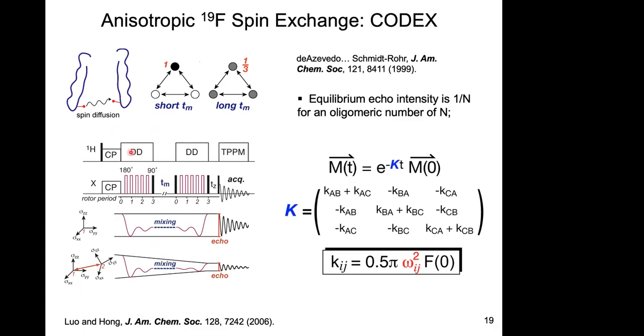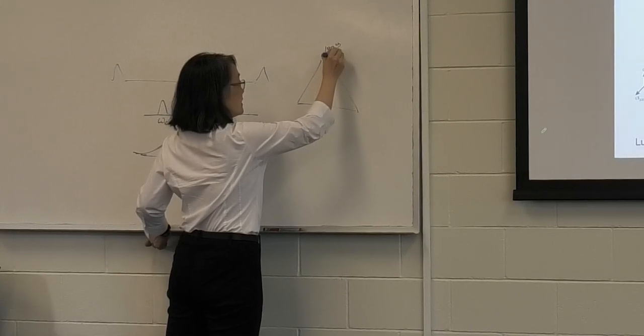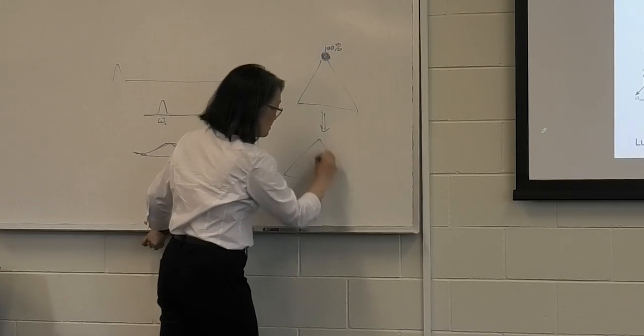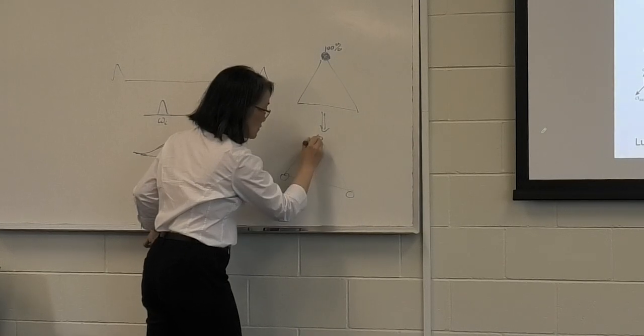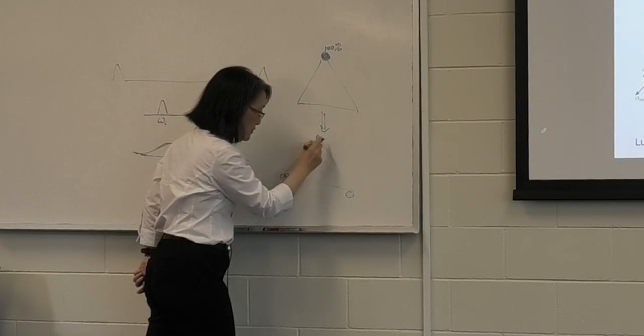spin. The idea is that if, say, you have a cluster of 3 spins with the same isotropic shift, but different anisotropic shift, then as your magnetization gets spread and equilibrates among all 3, the original site will only retain 1/3 of the intensity that is at the same tensor orientation as before. This slide doesn't have a typical picture. So if you have 3 spins and you started out having intensity all on this one, by the time you equilibrate your intensities, each one will get 1/3, assuming these spins are not too far from the original one.